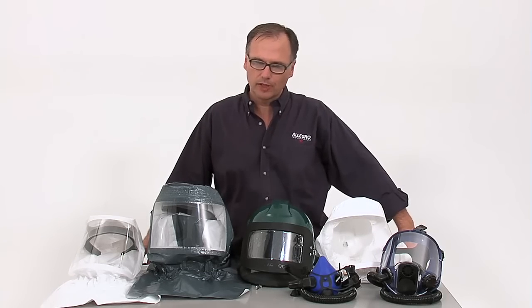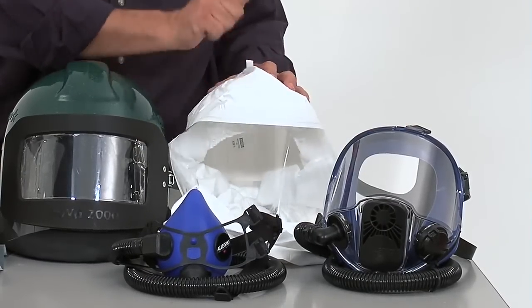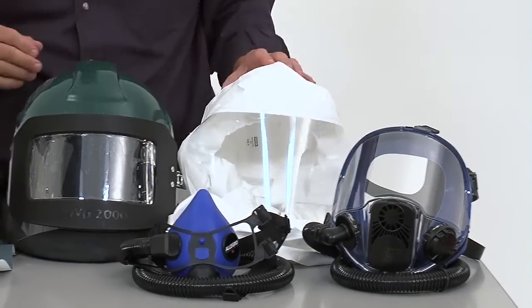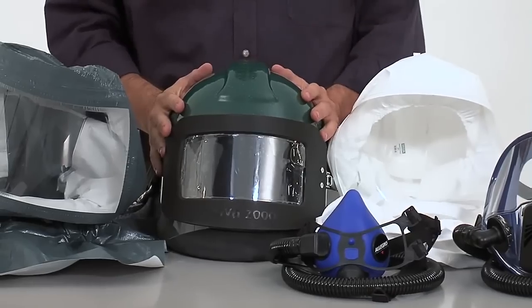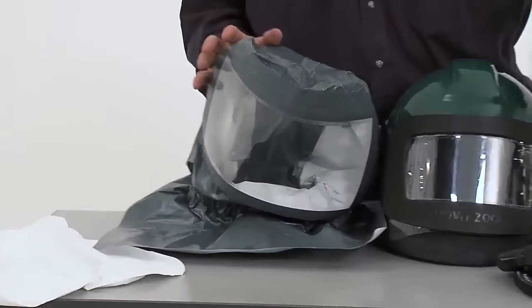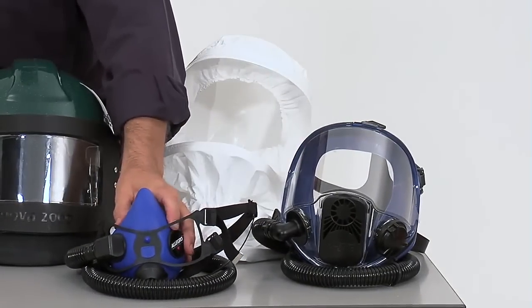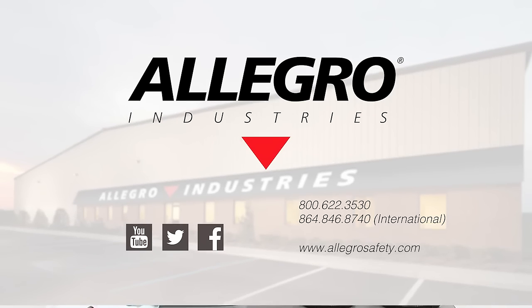Allegro Industries has a number of respirators for you to choose from depending on your specific work environment. If you are going to be doing painting but also need head protection, this helmet is great if you are doing abrasive blasting. This is good for chemical and hazmat. This full mask provides eye protection and respiration. The half mask is used where no eye protection is needed. It is best to consult your safety specialist or call Allegro to assist you with your respirator selection.